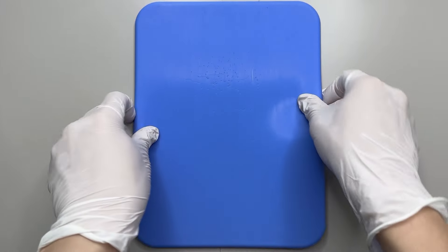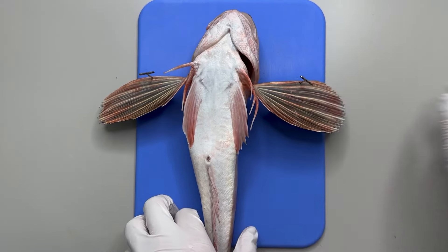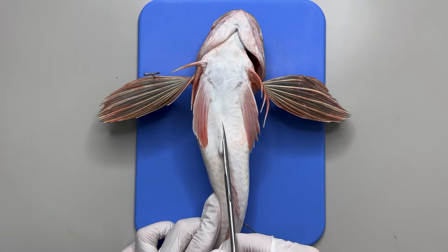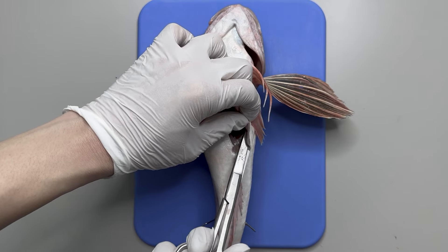First, we prepare the dissection board and secure the gurnard with dissection pins. In fish, the internal organs are located between the anus and gills. So we carefully cut through this area, and then trim the surrounding muscles.